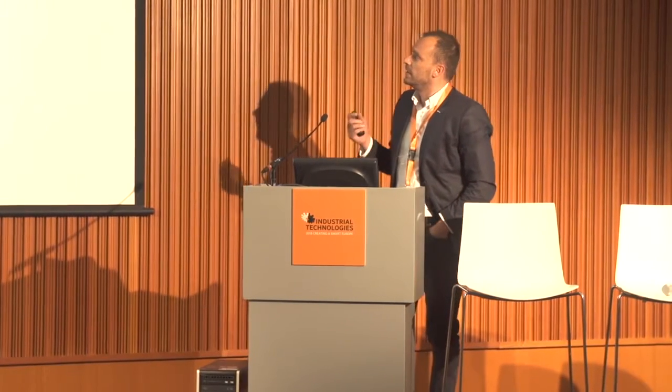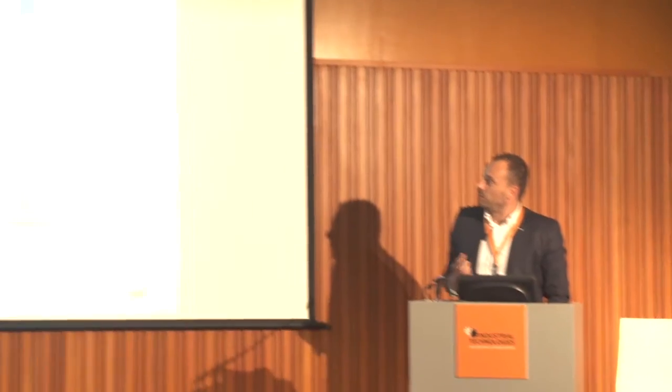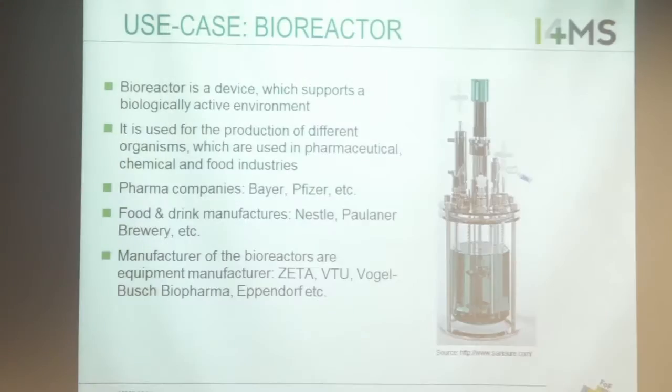And first of all, I would like to answer what is a bioreactor. A bioreactor is a device which supports a biologically active environment. We are producing living organisms like bacteria and cells. It's widely used in pharmaceutical, chemical, and food industries.